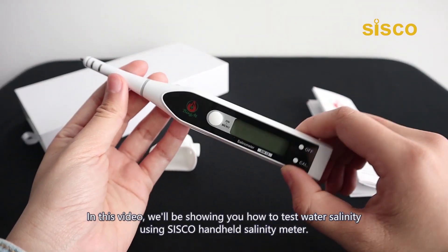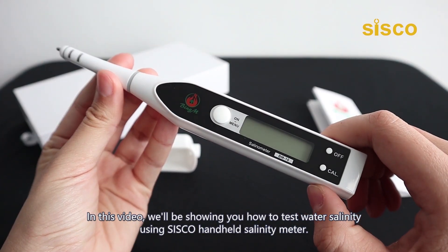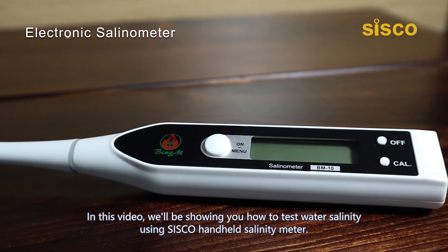Hey, what's going on folks? In this video we'll be showing you how to test water salinity using a SISCO handheld salinity meter.